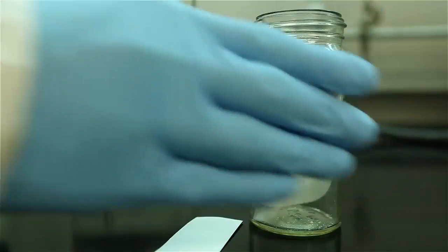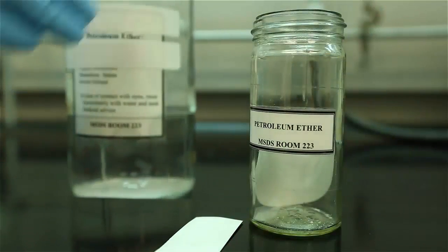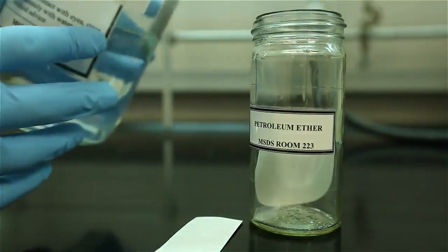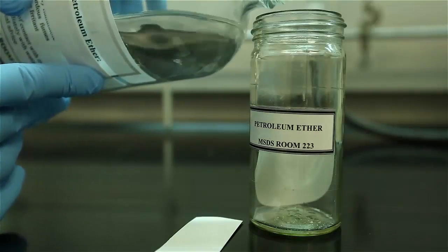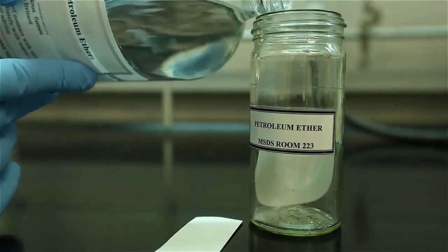You will be using a jar as a TLC chamber where the TLC plate develops. When you acquire a jar, be sure to check the depth of eluent to be approximately 0.5 to 1 cm and add more eluent as necessary.